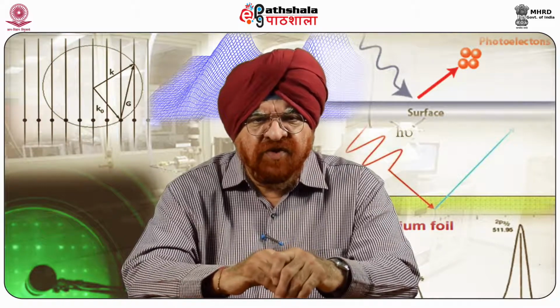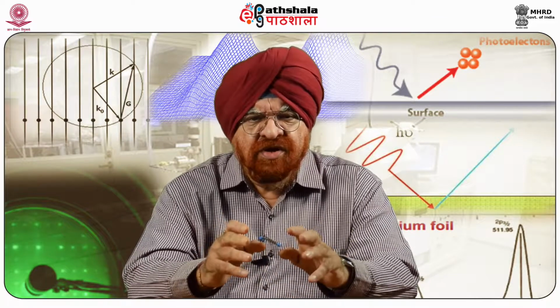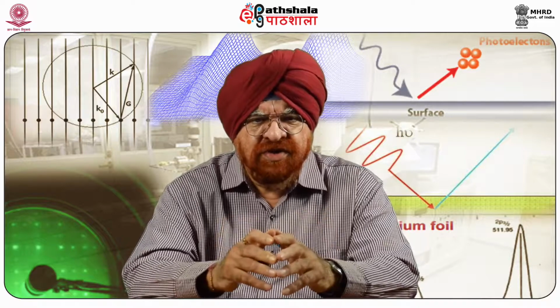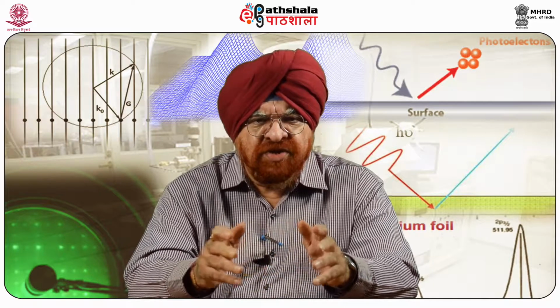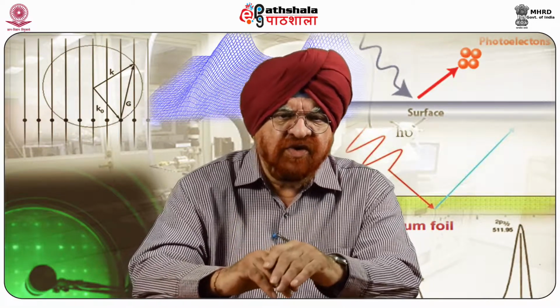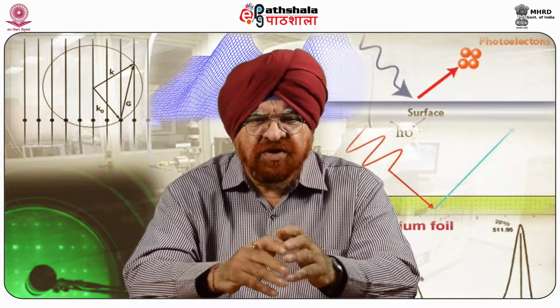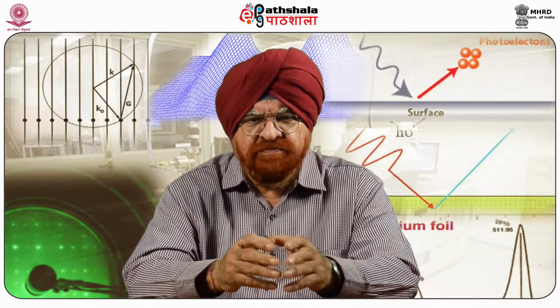Gradients in the magnetic forces on the tip shift the resonant frequency of the cantilever, and then we monitor this shift or related changes in oscillation amplitude or phase, which produces a magnetic force image. Many applications for data storage technology are there while using MFM.